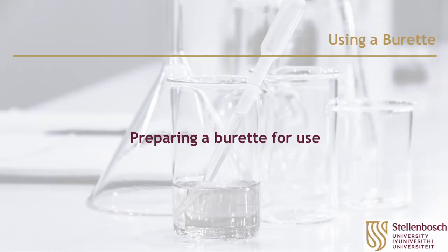To perform precise titrations with a burette, a clean burette that drains freely and does not leak is required.